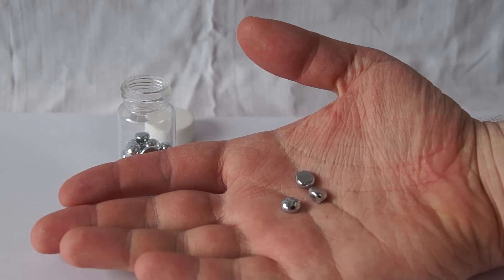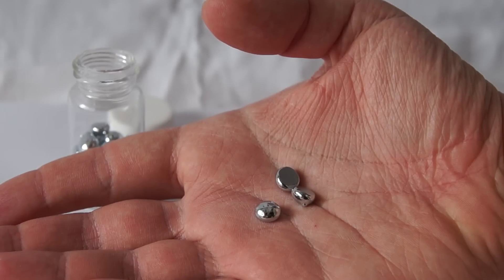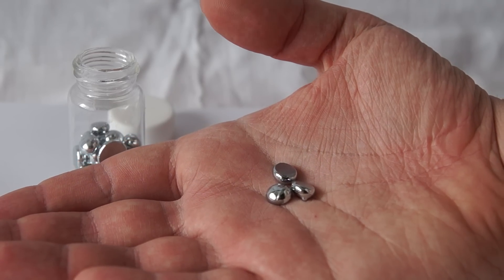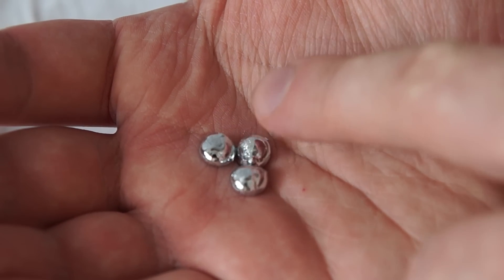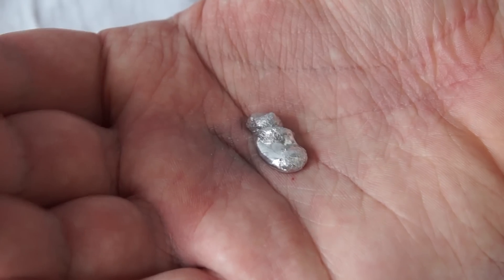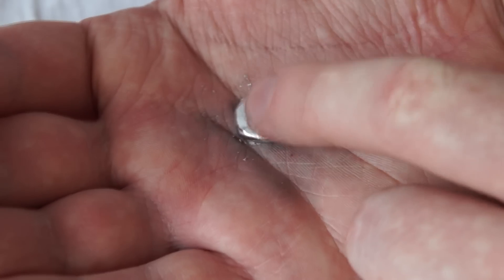Let's examine some of the properties of the metal. For this, I'll put a few beads of gallium on my hand. The melting point of gallium is 29.8 degrees Celsius. Since the human body temperature is 36.6 degrees Celsius, the gallium will just melt right in my hand. However, melting does not occur immediately, as gallium was previously at room temperature.